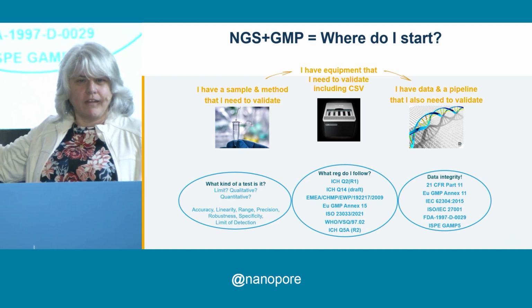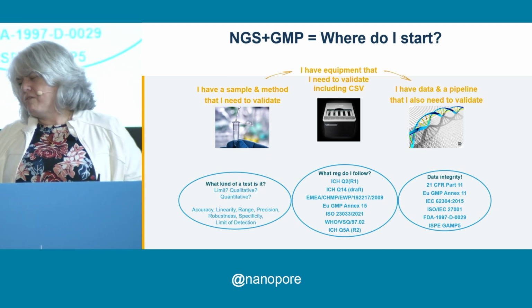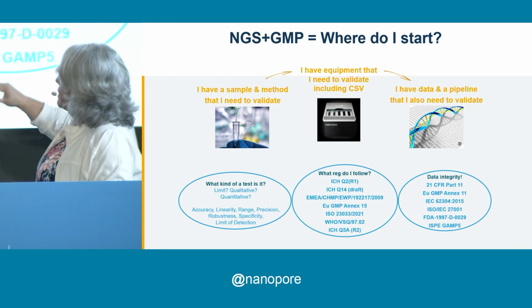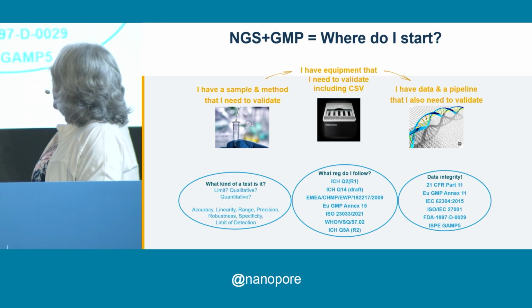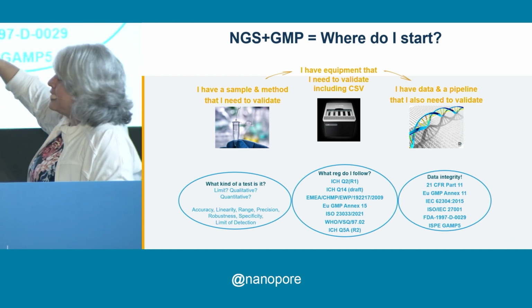And not everyone is aligned with one another. Some say you can test this way. Others say, no, not really, not here. So you have to try to align all of these things. But right now, most in the industry are following the ICH Q5A requirements. And that's great, because that governs your test. But you're not just thinking about a test.